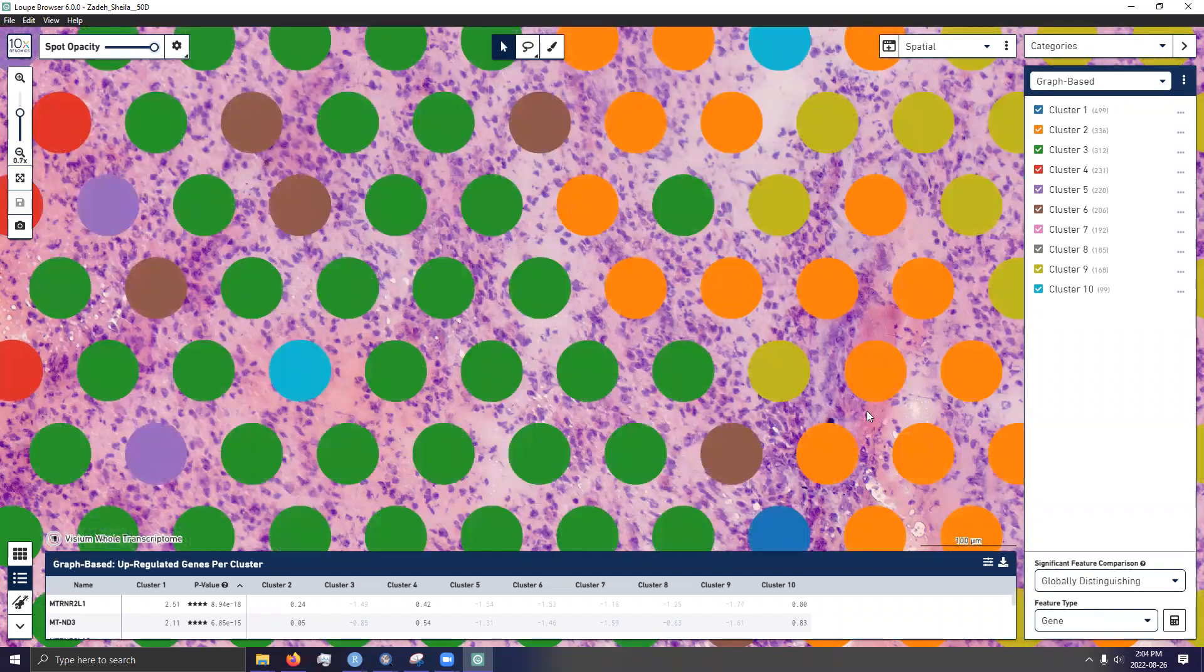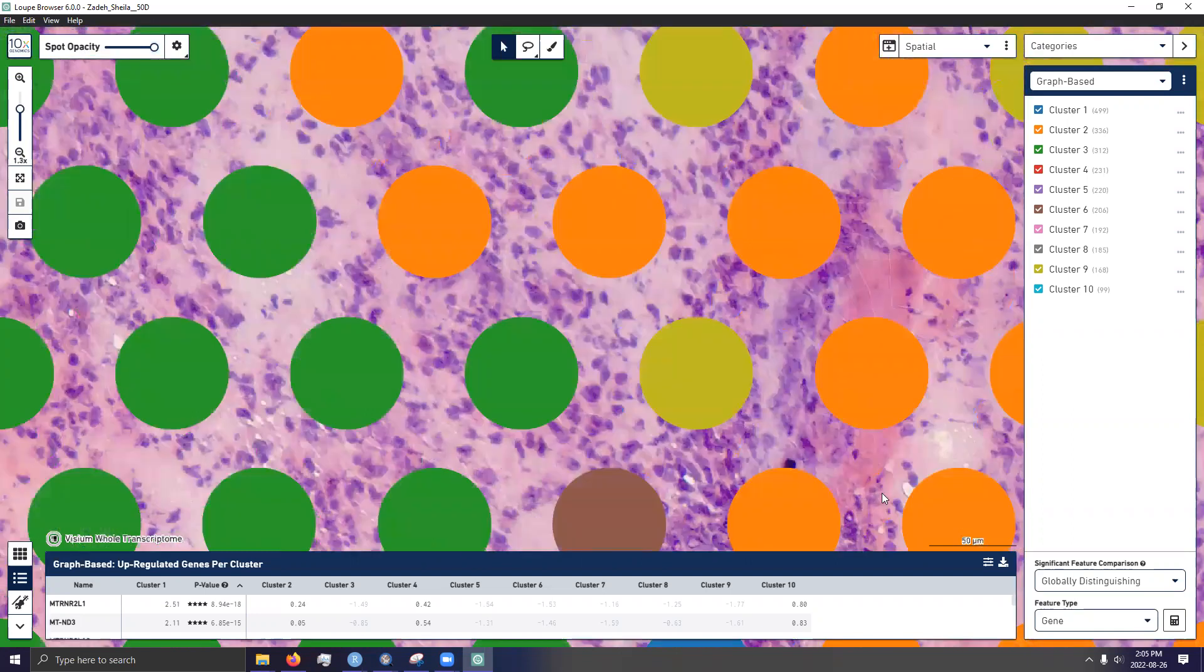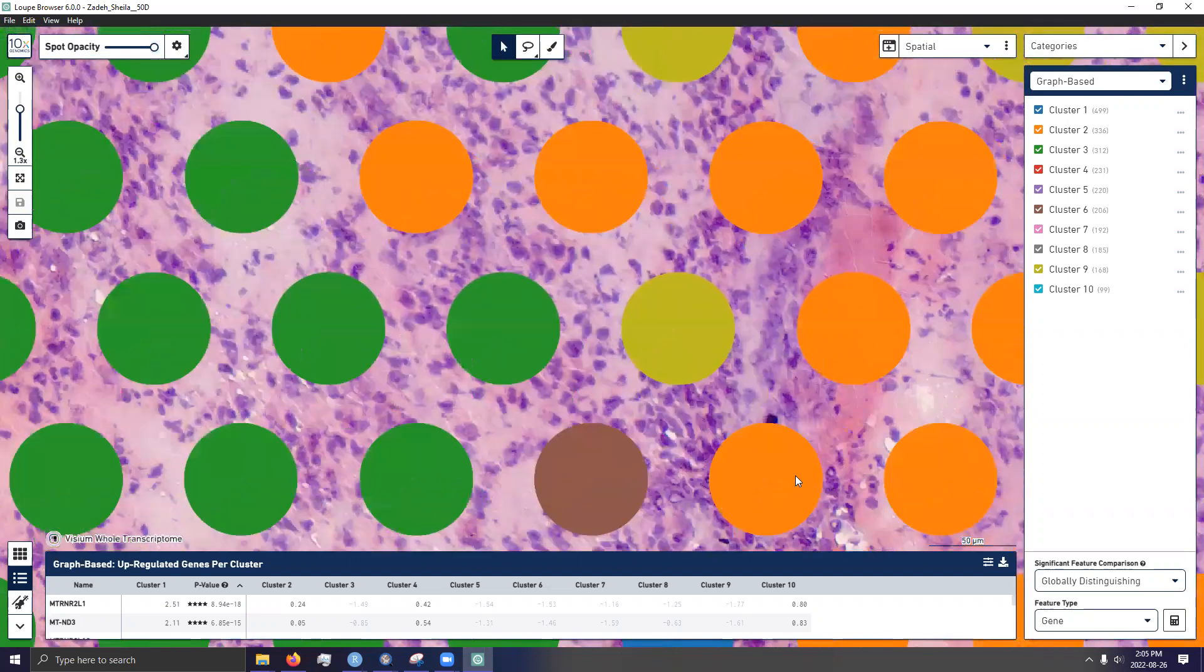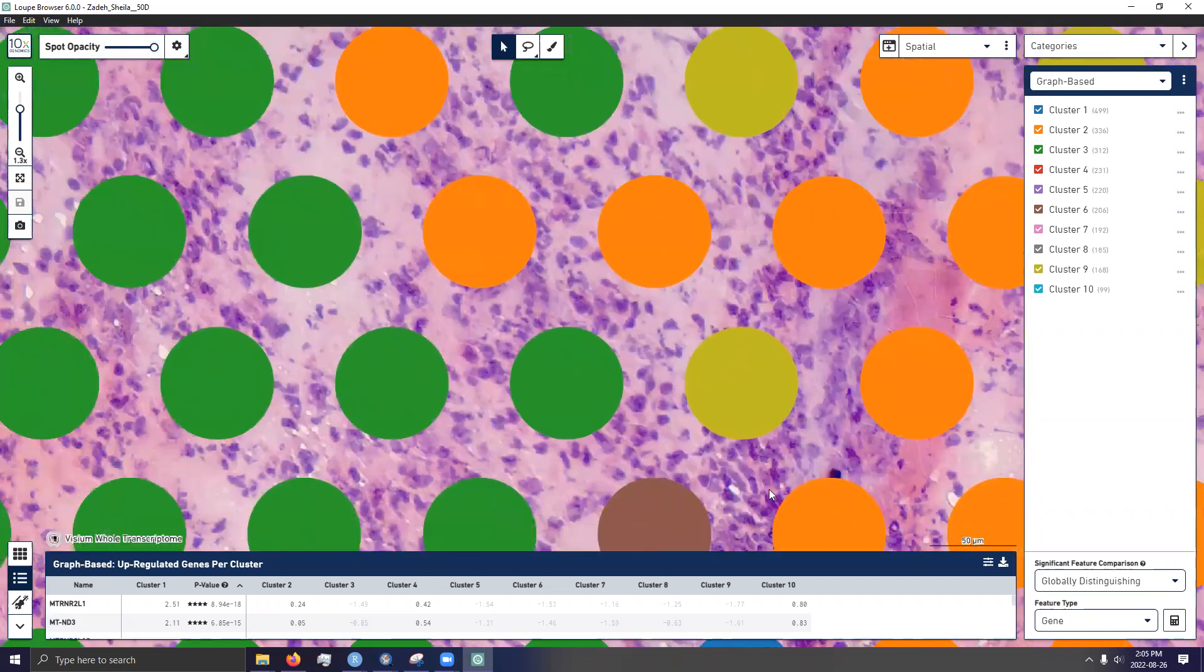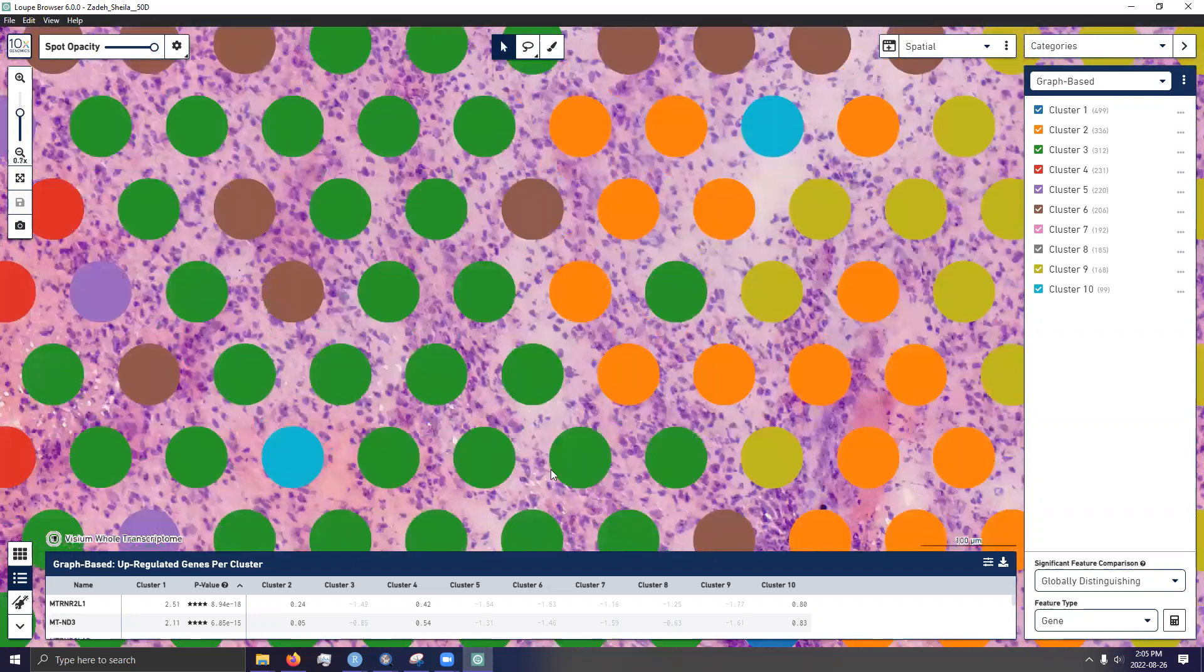Actually, I can just verify that by holding the scale bar up to it. Actually, I think it was 55 micrometer diameter and 110 center to center distance. Yeah, seems about right.